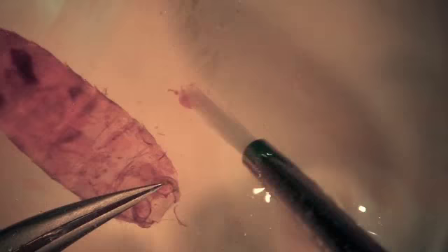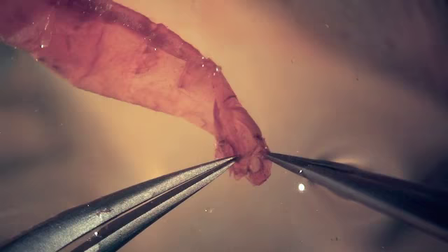After staining, the abdomen is transferred to 70% ethanol, where it is further cleaned. The abdomen is brushed from side to side to minimize tearing of the intersegmental membranes. After the abdomen is cleaned, two pairs of forceps are used to separate the ventral sternites from the dorsal tergites.